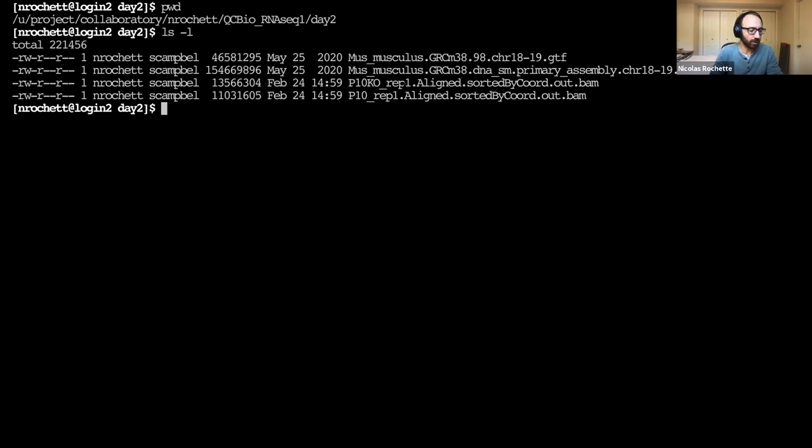And I'm not really sure what causes alignments to sometimes be fast and sometimes be slow. Is there just a source of variance on the cluster that I can't pinpoint? I'm not sure how long it's going to take today. In the previous workshop, we were a good number of people, so it might have to do with too many people trying the same thing at the same time. Although they're not that memory expensive jobs, it might have to do with the fact that we're working in the home directories rather than on the project directories, which should in principle be faster and more optimized for large files.